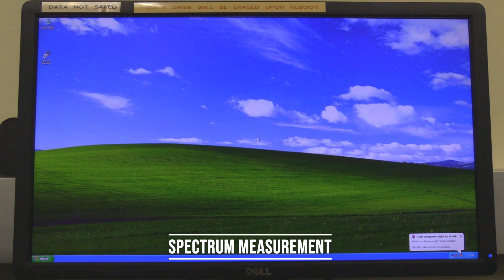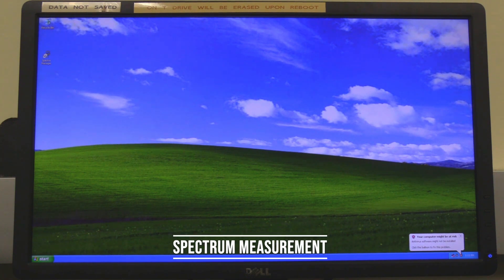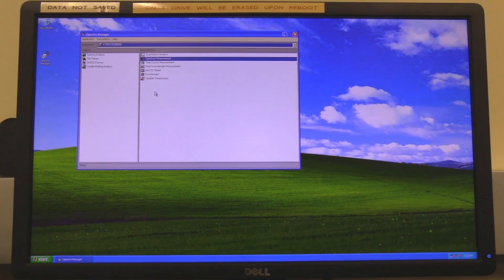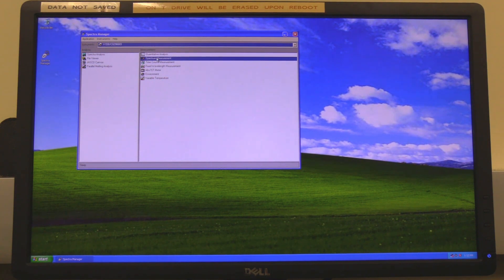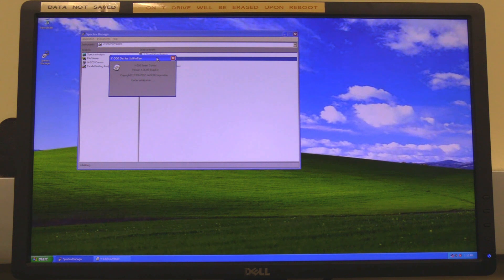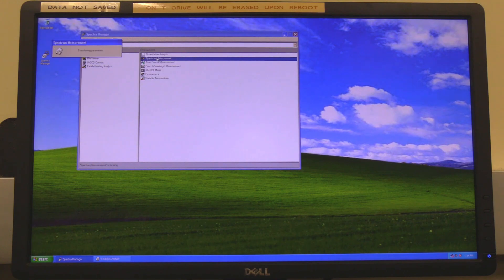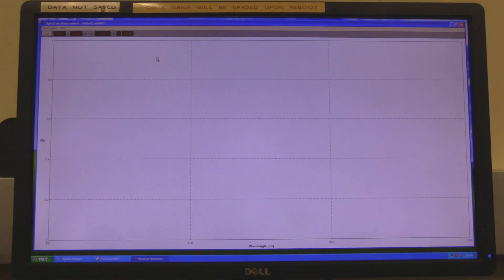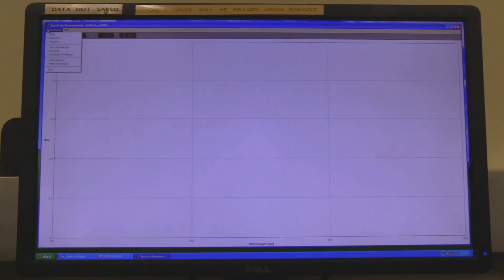Spectrum measurement. On the desktop, double click on the spectrum manager icon. When spectrum manager opens, double click on spectrum measurement. Wait for the software to open and initialize. If this is the first time the computer is communicating with the instrument, the initialization process will take a few minutes. Click on measurement and then on parameters.